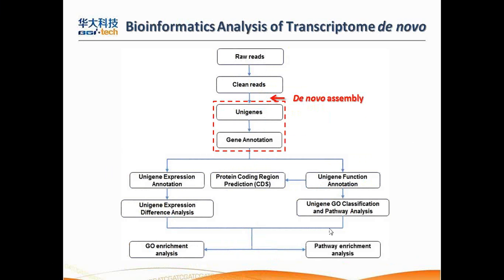This slide I just mentioned is about de novo sequencing. You know that there is the de novo assembly of the RNA sequencing reads, and there is an annotation of all those genes in this transcriptome.